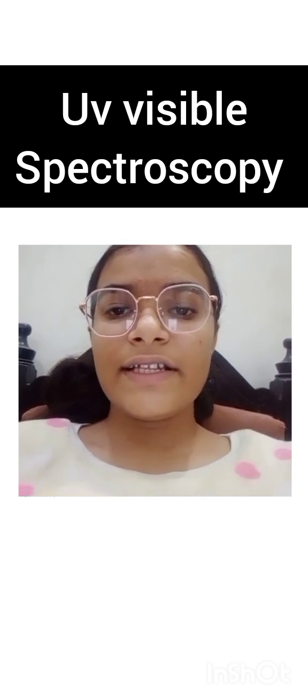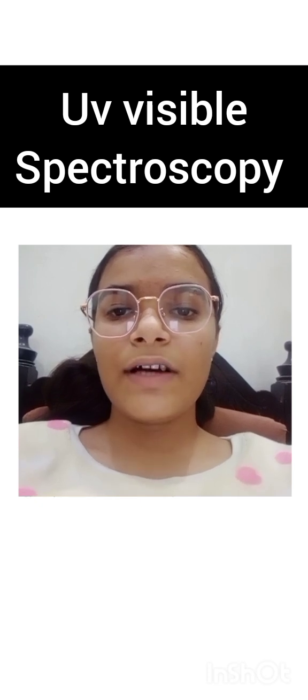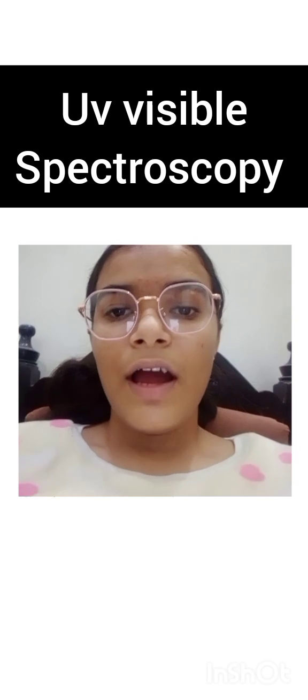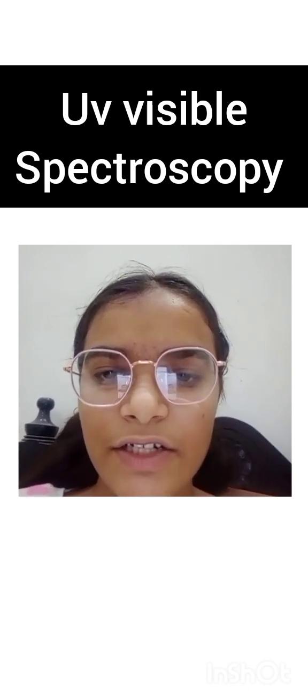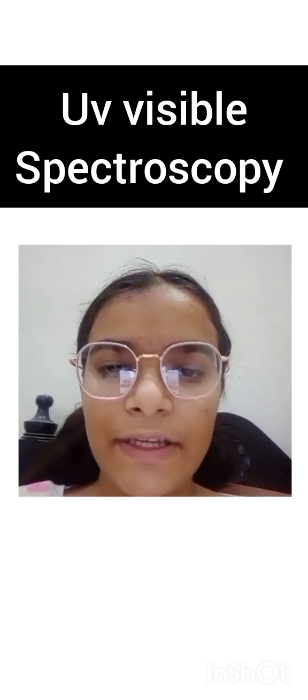I is the intensity of the radiation emerging from the sample. L is the length of the path through the sample, and C is the concentration of the sample in moles. I naught is the intensity of radiation entering the sample. I is the intensity of radiation emerging from the sample. C is the concentration of the sample in moles per liter.